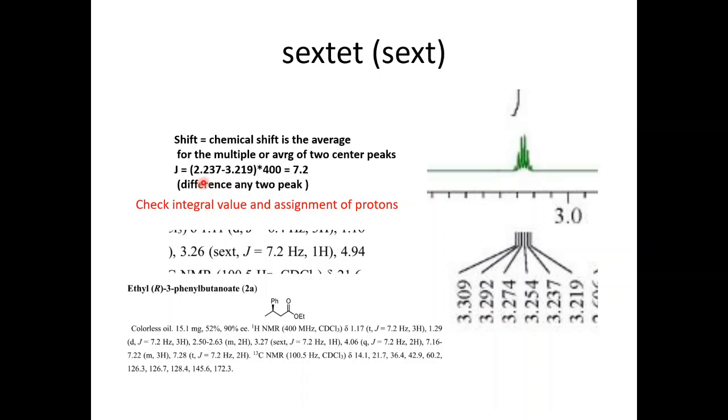So they have 2.725. So average is approximately 3.26 and sextet. Now J value is 2.37 and 2.19. Why did the author take these two, not this one? Maybe they will get 6.91, 7.1 which does not agree with other peaks. So you should report the J value which agrees with other peaks. So 7.2 will agree with other protons coupling to the other protons. So they are reporting NMR like this. So you can see here 3.27, sextet 7.2. You will see other peaks also 7.2, 7.2, 7.0. So if you take these two maybe you get 7.1, but you have to take care of the J value of also other peaks. So click on this, click on this, click on this, calculate this one - 7.2.